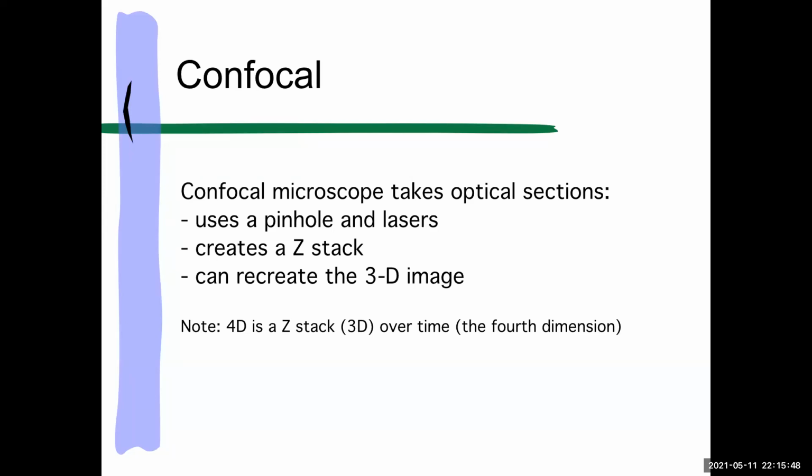The confocal has the best optical lenses in the objectives. They are literally selected at the factories in Japan and Germany, like hand selected out as, you know, let's put the best glass in the confocal objectives. And then everything is motorized. You really operate the whole thing from the computer. Every single component is motorized. The only thing you ever do physically is put the slide on there, and then the motorization basically takes over.